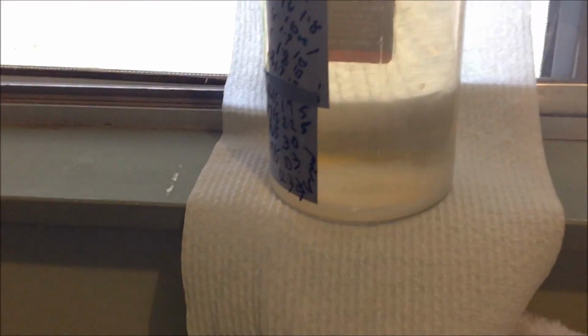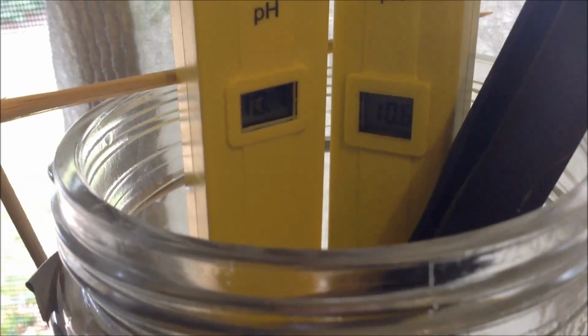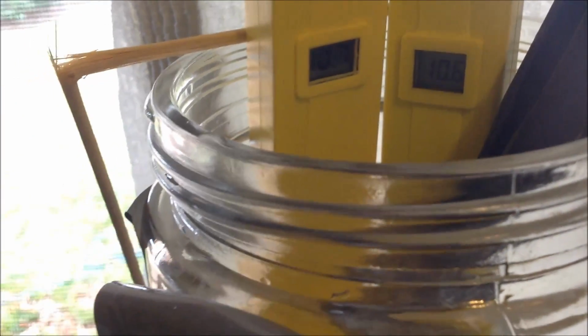Slightly yellowy brown, but that could be the dye from the water from the shoelace. Okay, I'll proceed to bring the pH back up to 10.7. It'll only take a few mil, I think. As expected, it didn't take much to get to 10.6, 10.7.